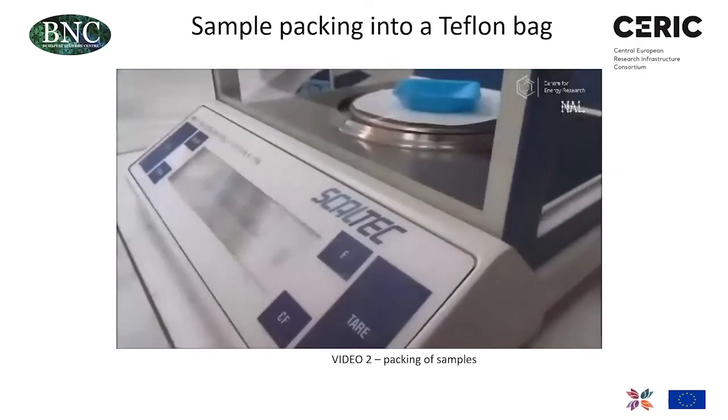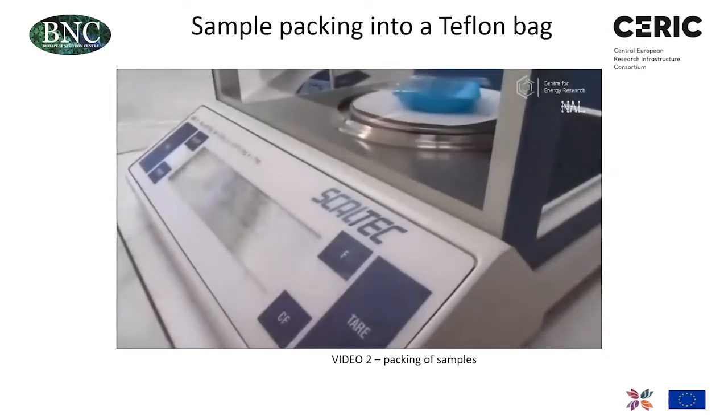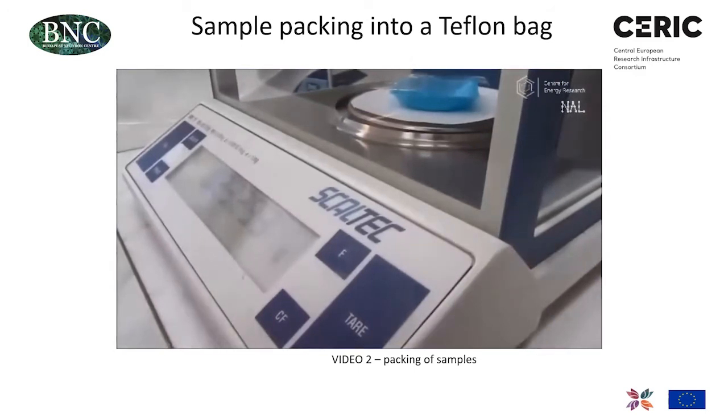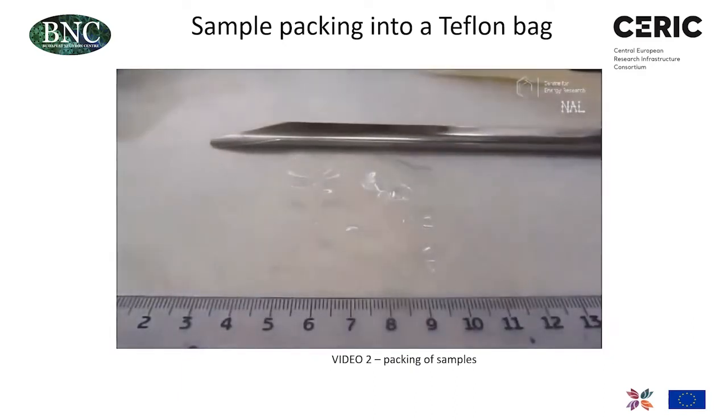We usually measure the weight, but seriously speaking, this is not required for the calculation, because in some cases we do not irradiate the entire sample, so this balance weight is not relevant to the measured masses.